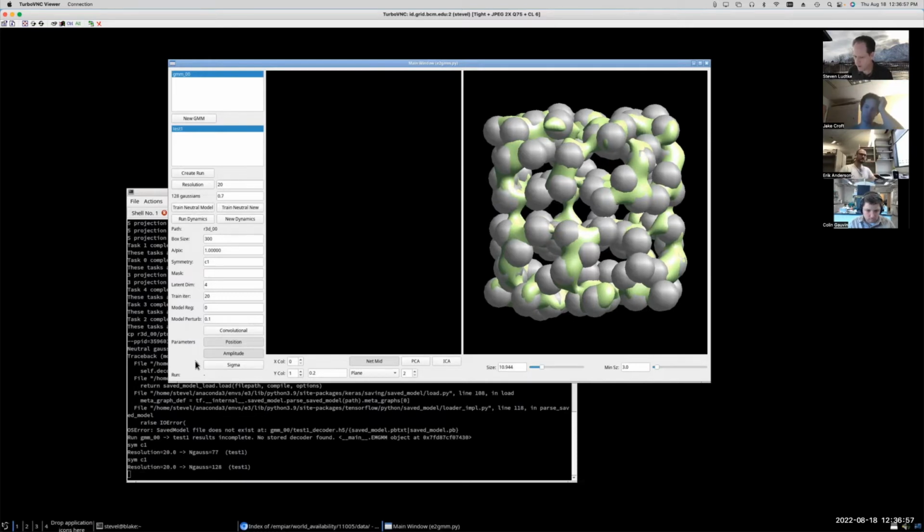If you allowed the sigma to vary by a lot, then it might decide to make several of the Gaussians really tiny so they could fit in some small feature or something like that, and it would kind of defeat the purpose of specifying the scale that you're working with. The mathematical reason is that the math becomes massively more efficient if you don't allow that to vary, which allows us to make it run a lot faster.